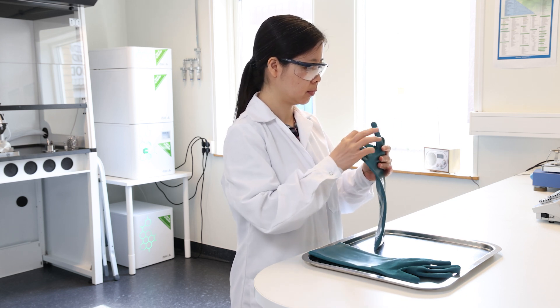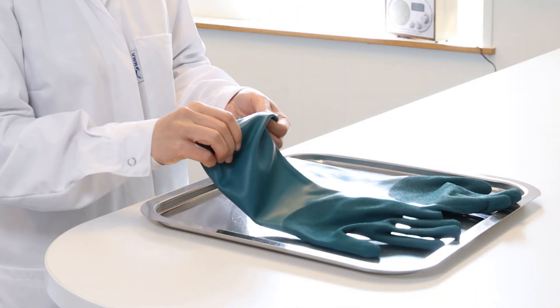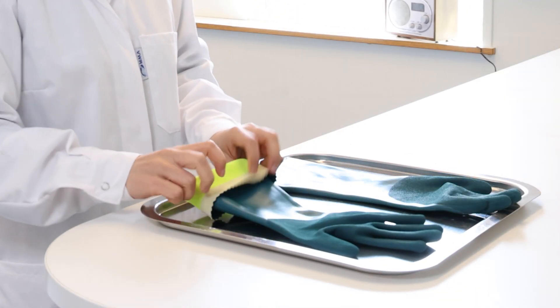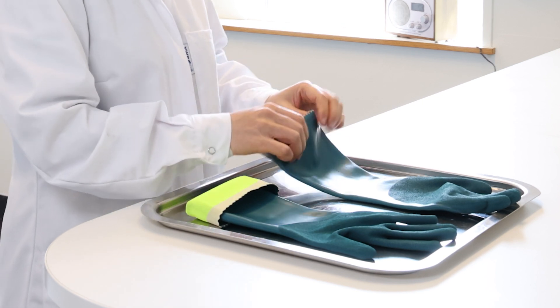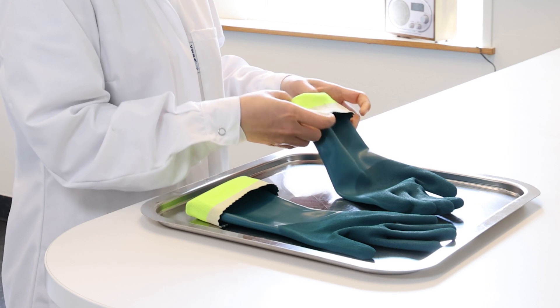An important step is to put on and take off the glove. Before putting it on, it may be useful to fold an edge in the opening of the glove. When you work and hold your hand in the air, flowing liquid ends up in the edge instead of flowing into the sleeve.